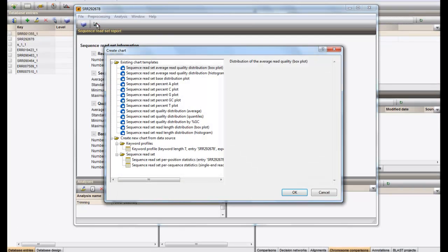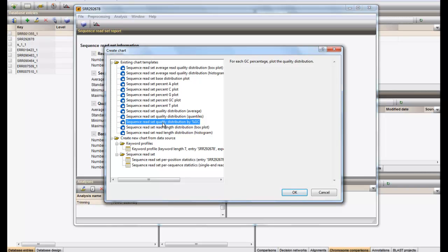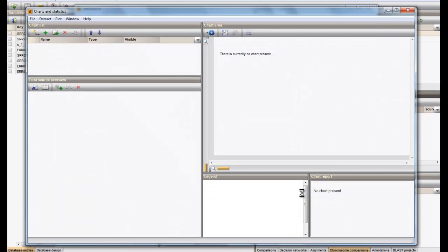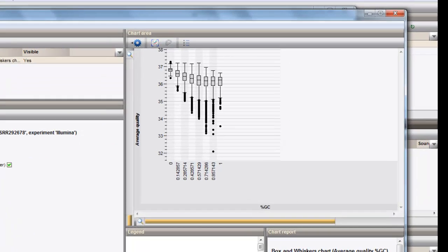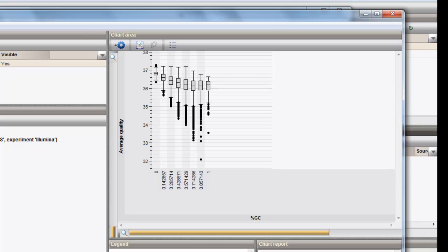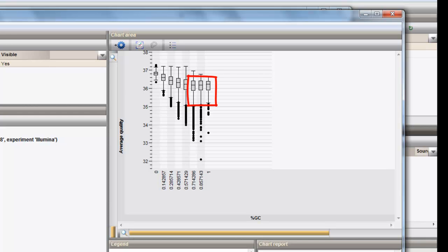As a last example, we can create a chart for the quality distribution by %GC. From this graph, we can see the read quality distribution over the %GC range. This graph shows us that for this dataset, the low-percent GC reads are generally of higher quality than the reads having a high GC content.